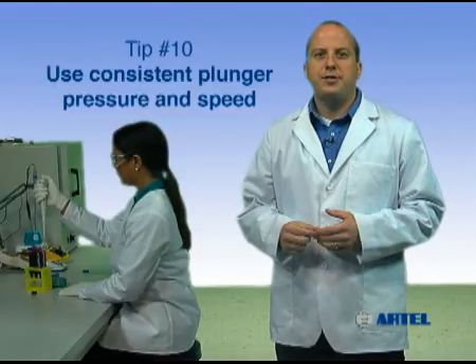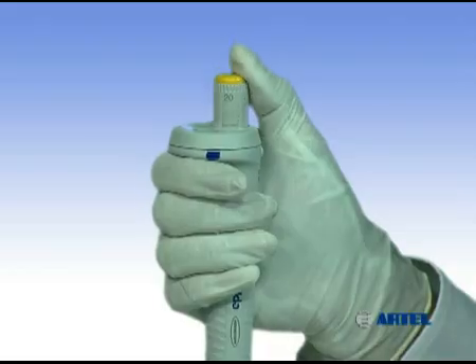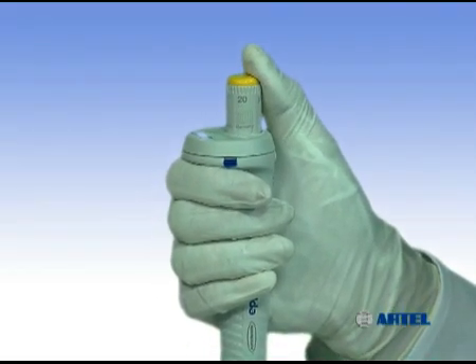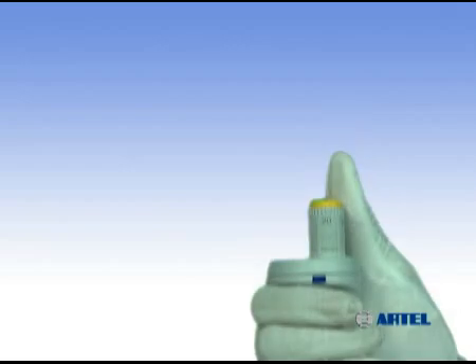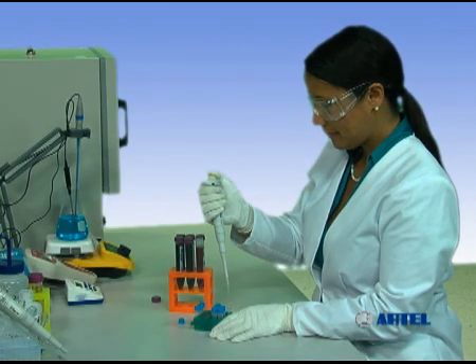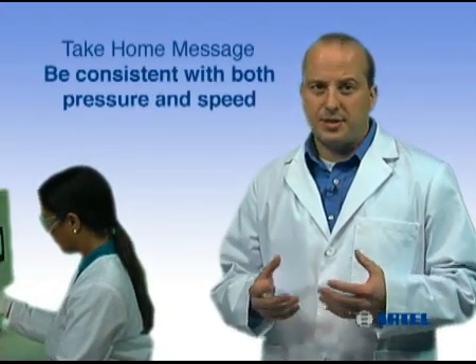Pipets, like all precision instruments, give more reproducible results when used with proper technique and when the user is paying attention to detail. It's important to have constant, steady plunger movement during sample aspiration, as well as during sample delivery and transfer, because inconsistencies in technique will allow air to creep into an assay or process. The take-home message is: depress and release the plunger smoothly, with consistent pressure and speed, during each sample transfer.